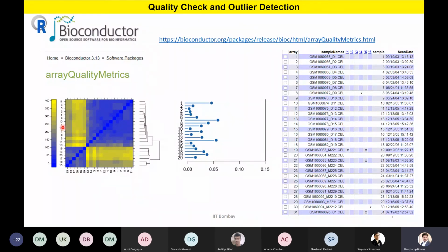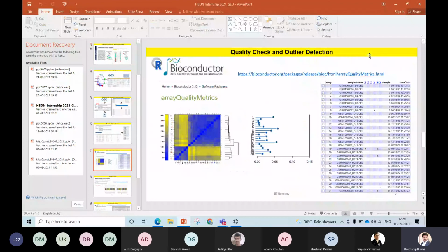First we will see the sample to sample expression, then whether there is an outlier or not, and once the analysis is over, it will give you a complete file which shows which files are acting as outliers. For example, these 1, 2, 3, 4, 5, 6 are nothing but six different levels of analysis that they have done, where they have tried to understand which are outliers.